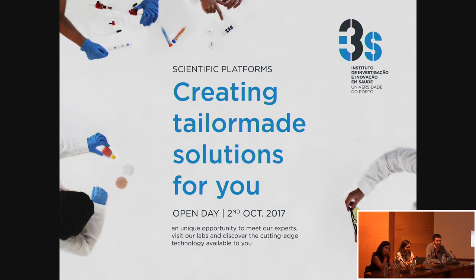Okay. And the orientation issue, with zebrafish, if you do the screen, you sometimes have the difficulty that they are oriented very randomly. And sometimes you need them in a sort of directed position. Exactly.